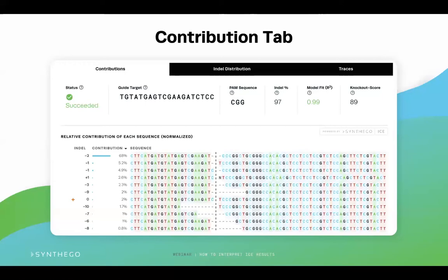Next to the guide sequence, you can find the PAM sequence. The protospacer adjacent motif, or PAM, is a sequence ICE identified as the target site your Cas nuclease found to initiate nucleic acid cleavage. Also on this tab, you can see the indel percentage, which should be the same as the indel percent from the previous page. Following the indel percent is the model fit, or R-squared, of this sample analysis. The R-squared represents how well the indel distribution fits the Sanger sequence data of the edited sample and has a maximum value of 1. It sets the maximum for the indel percentage, knockout score, and knock-in scores. Additionally, the sum of all contributing sequences will add up to the R-squared value.